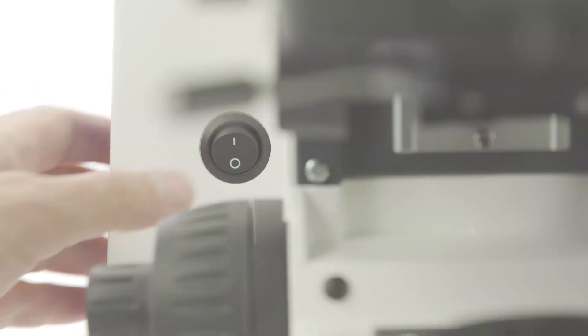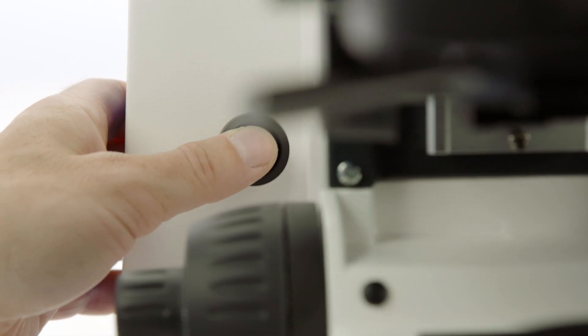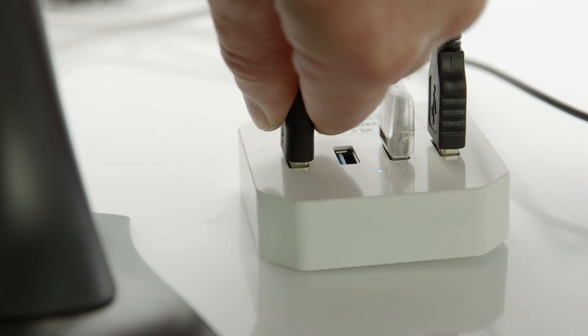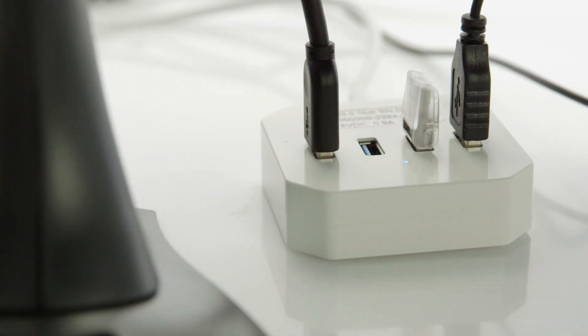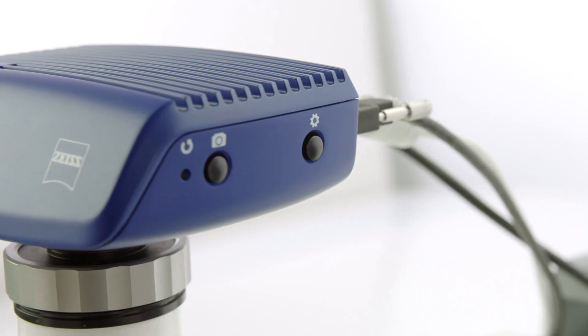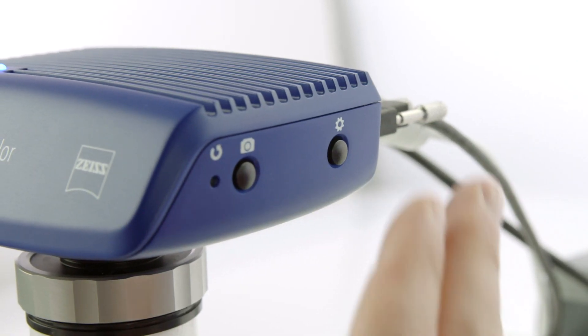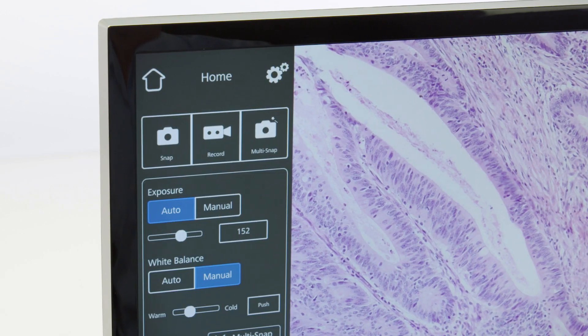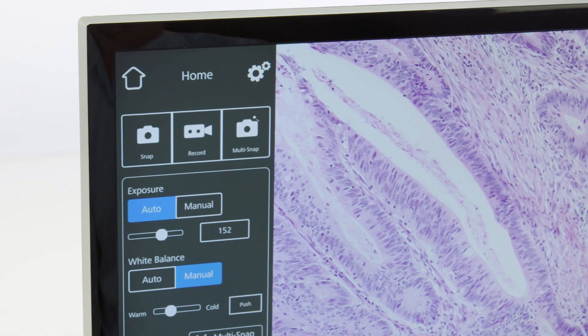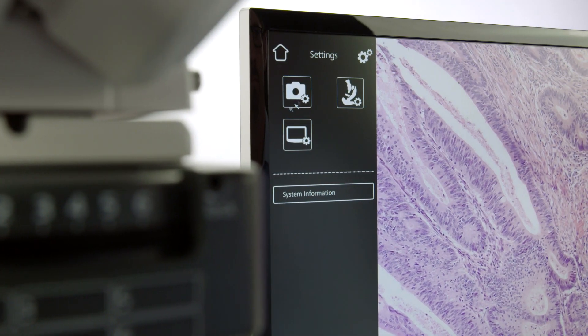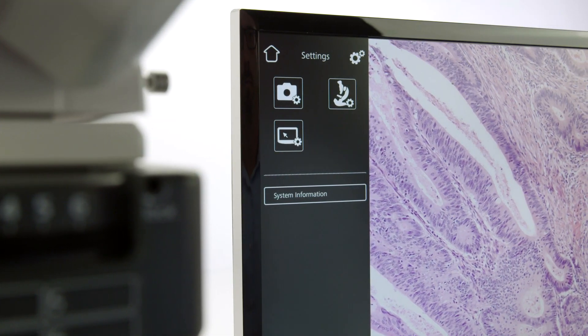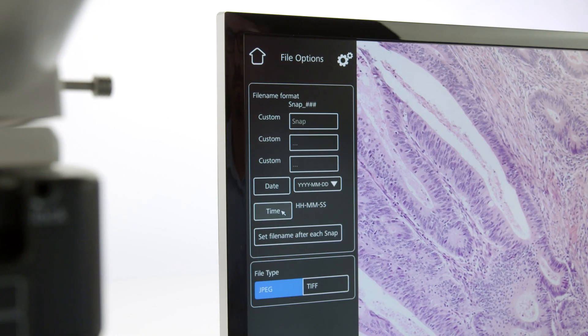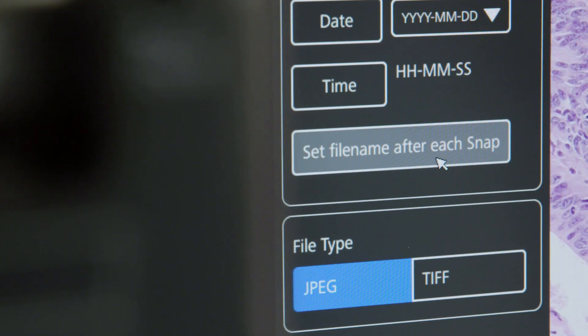Here's how it works. Switch on the microscope, insert a standard barcode reader into the USB hub, and activate the on-screen display using the corresponding icon on the microscope camera. Activate Set File Name after each snap in the file options.